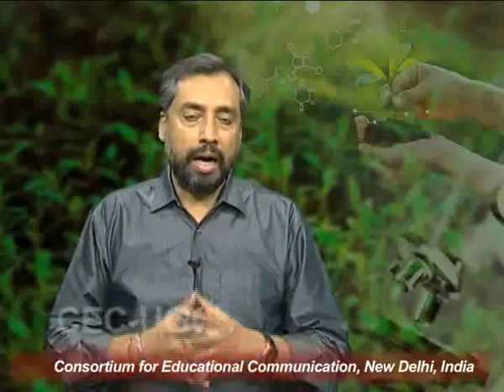Now, after understanding the basic principle of scanning electron microscope, let us try and understand how the samples are prepared for observation under scanning electron microscope.